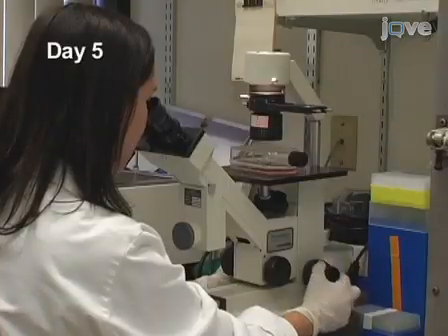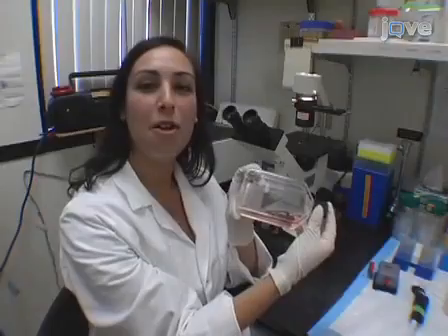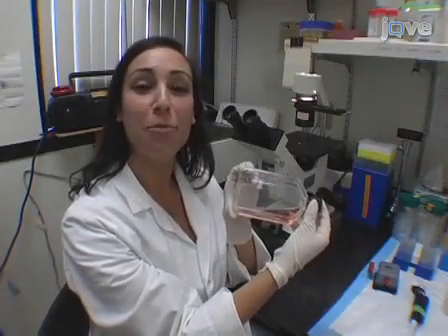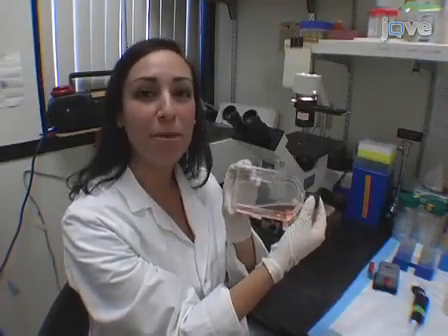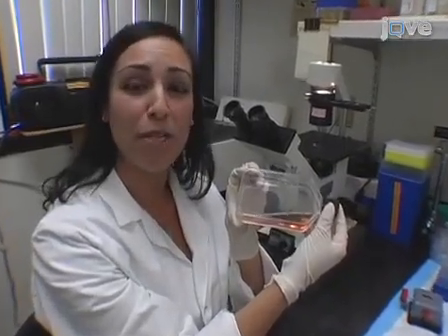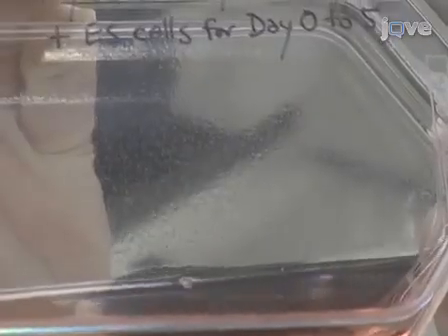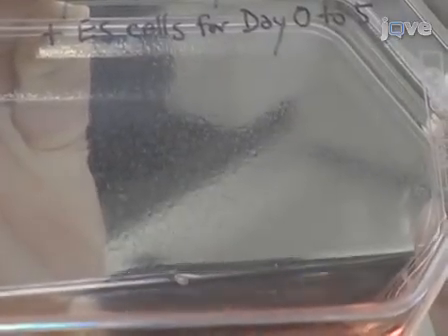5 days after the start of the co-culture, proper differentiation of ES cells on a confluent layer of M-strawberry OP9 cells should result in hemangioblasts, which appear as piled-up whorls of cells. The most critical aspect of this procedure is making sure you get proper differentiation on day 5 of co-culture. At this point, you could see the hemangioblast colonies not only microscopically, but macroscopically as well.